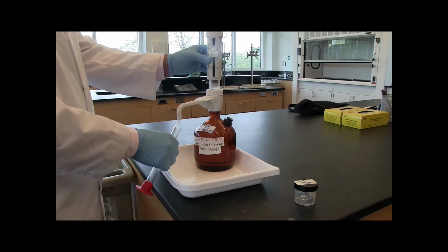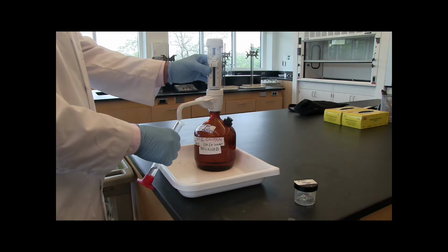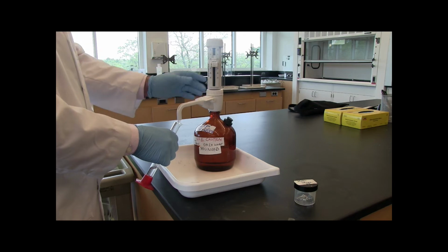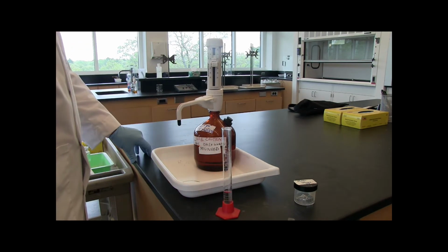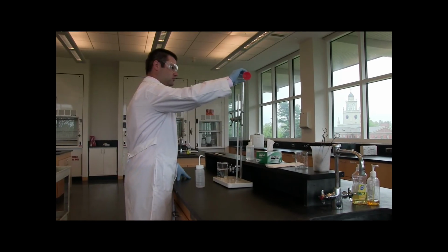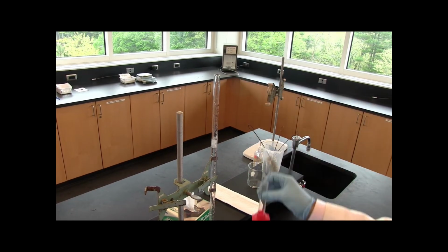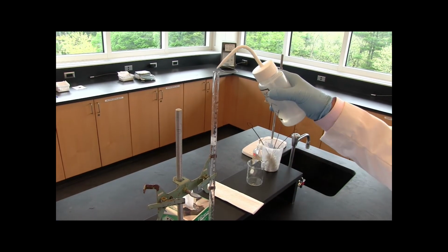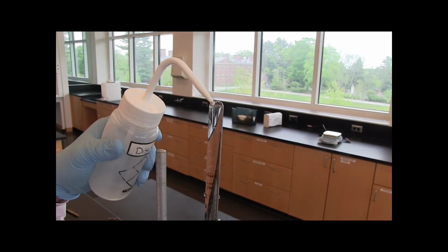pull up, and then slowly press down. Remember to replace the top when you're done. So now that we have our 10 milliliters, pour it carefully into the eudiometer. Next, fill the rest of the tube with distilled water, leaving yourself what I think is a pretty cool looking meniscus that protrudes at the top.